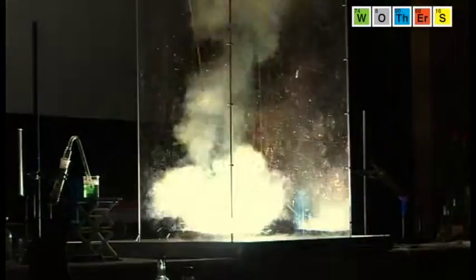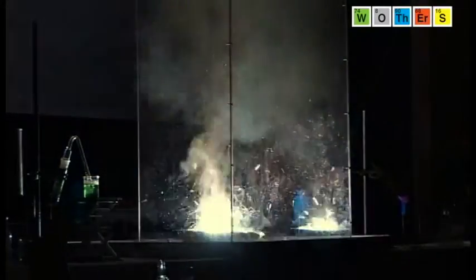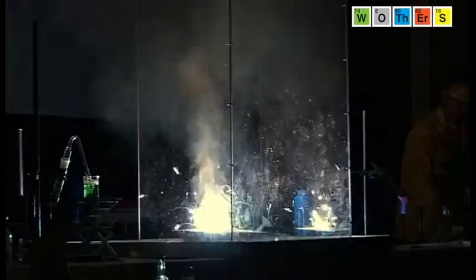When the lights go down we'll add a light and you may see the combination of the iron and the oxygen. Well, I think that was fairly conclusive.